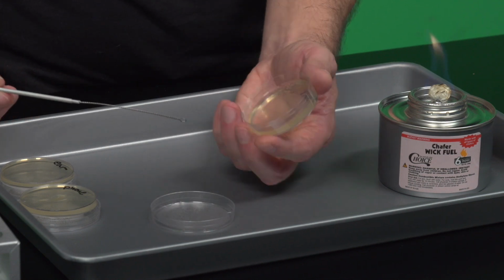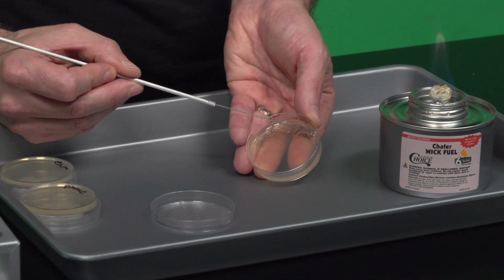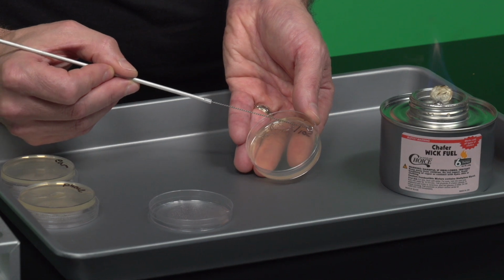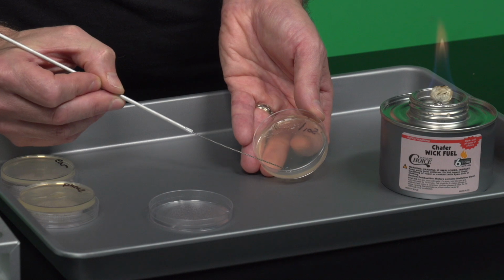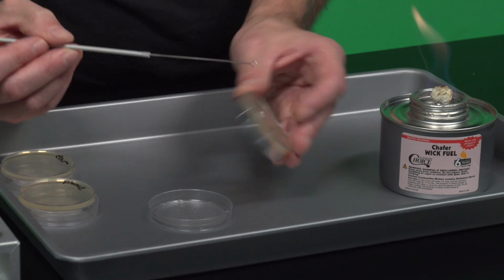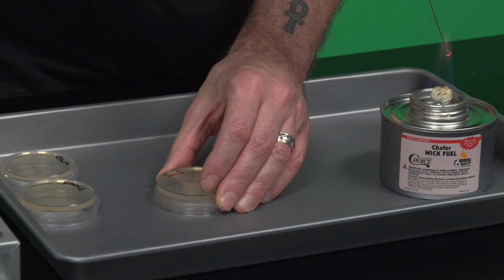Now this one I'm going to do like this so that hopefully it's a little bit easier to see. Basically, quadrant 1 into quadrant 2, back to quadrant 1, into quadrant 2, back to quadrant 1, into quadrant 2. Now I'm staying in quadrant 2. I'm not going back into quadrant 1. Go ahead and sterilize the loop in between each and every one.